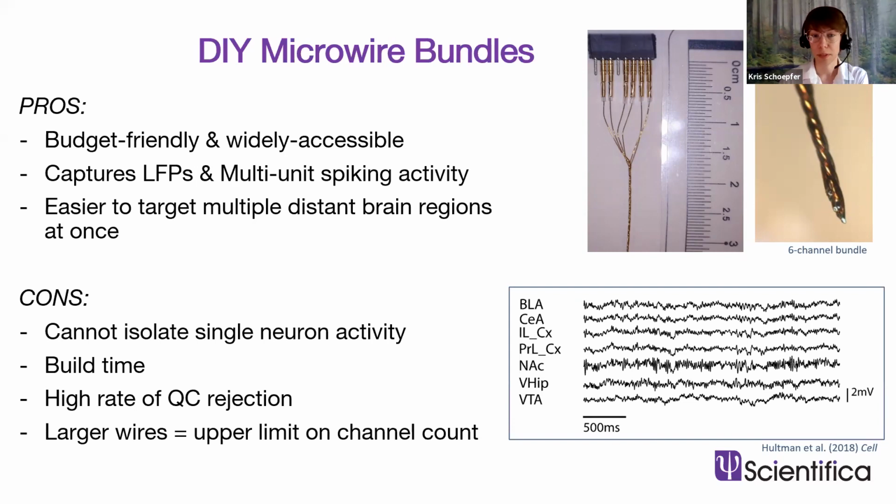There is a little bit of build time built into this, by nature. You're doing it yourself, so you take that risk. And because you're building it yourself, there is some rate and risk of quality control rejection here. And because these wires are somewhat larger in diameter, there's an upper limit to the channel count. You can't insert too much mass into the brain without hurting something.